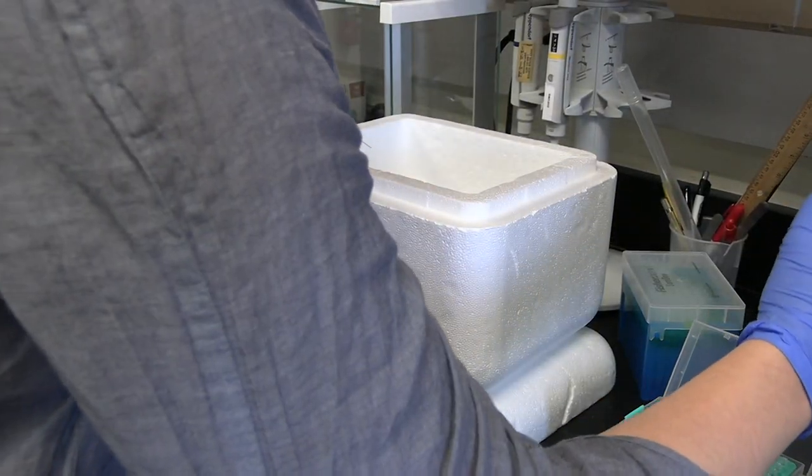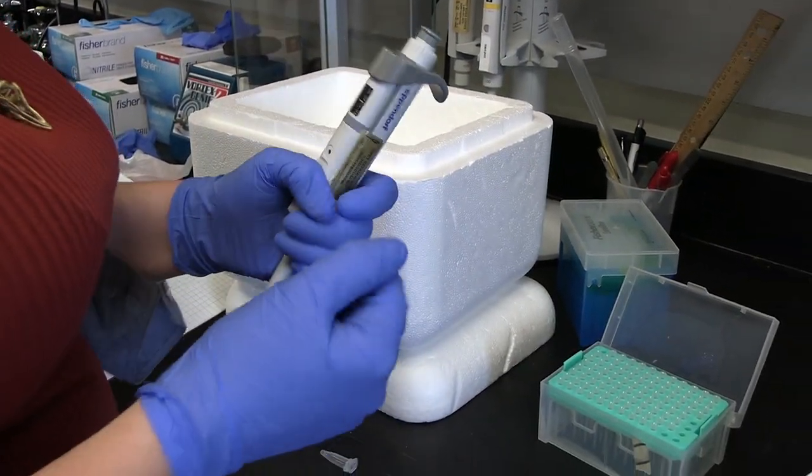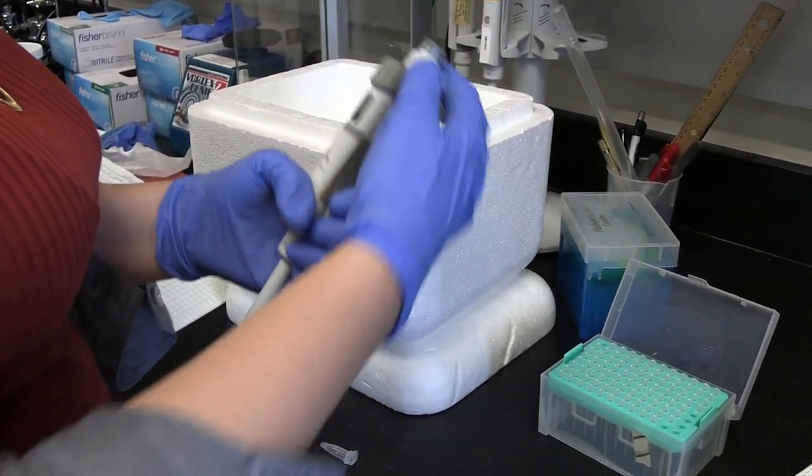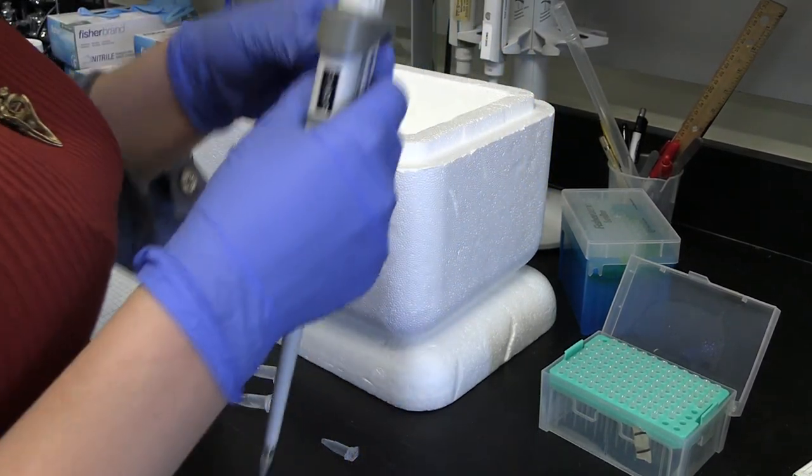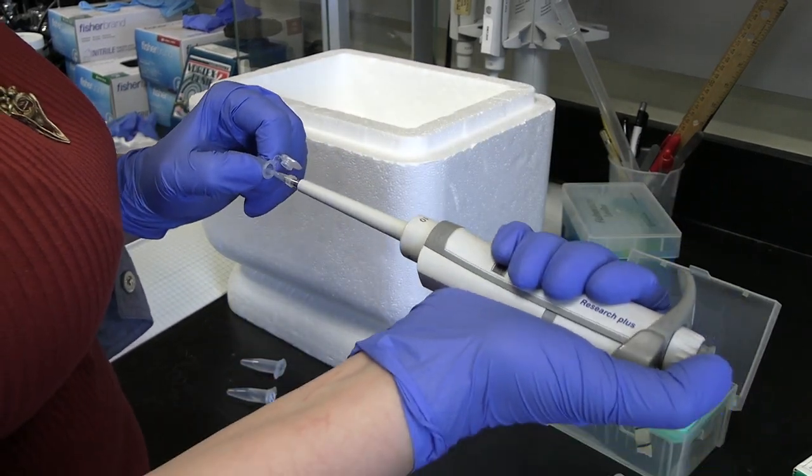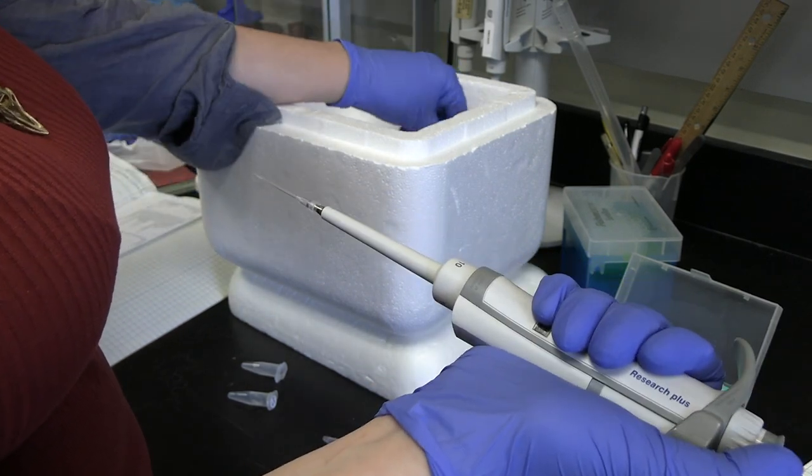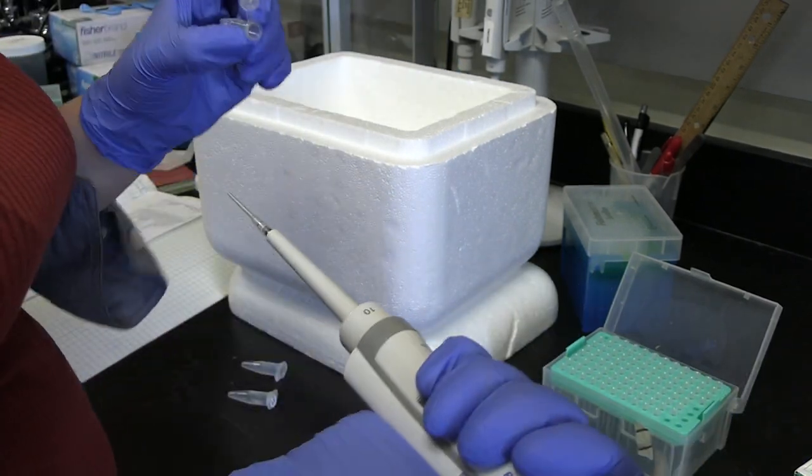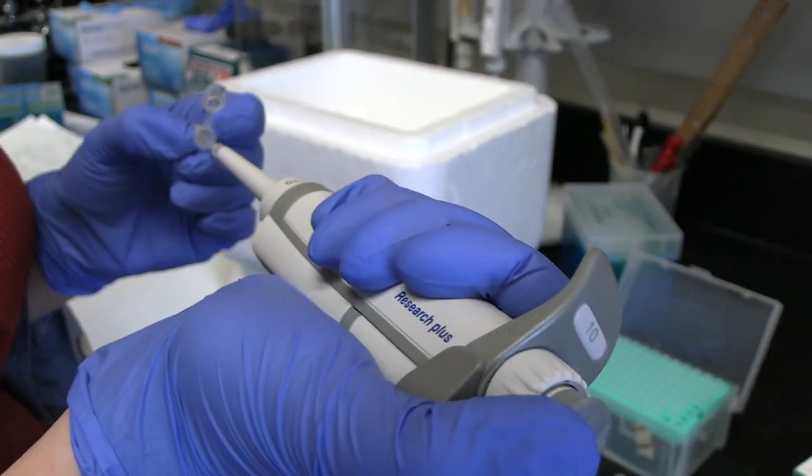The last thing I add is the kinesin clusters. You want to add that last to have the most control over when your sample starts the activity. 2 microliters out of what we prepared before. Since our network is polymerized, you want to take care to pipette it very gently.